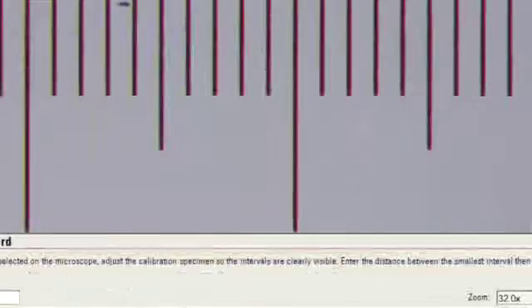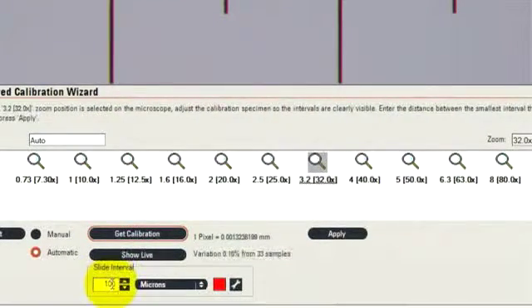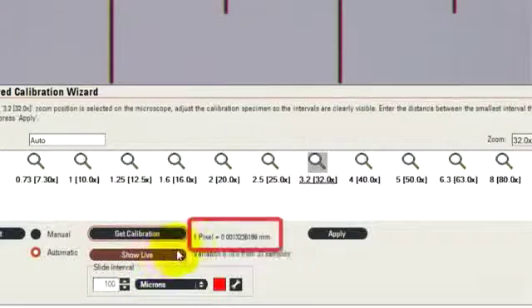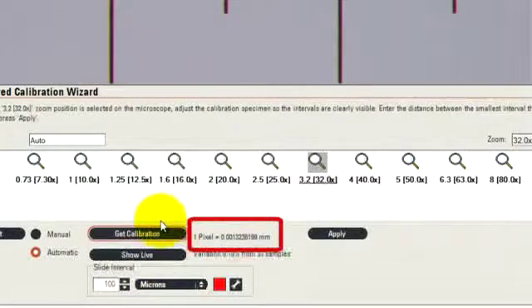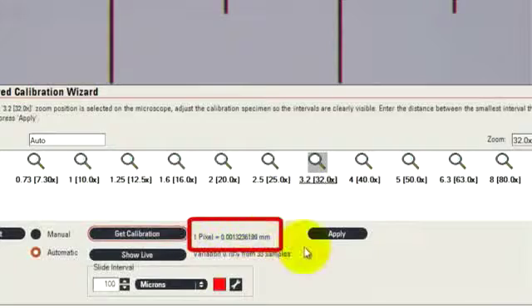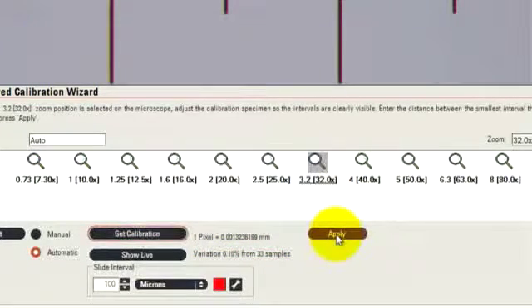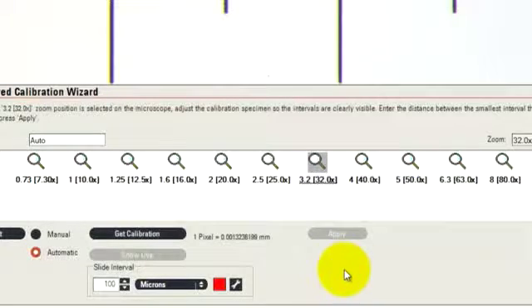Because we knew that the interval was 100 microns, the calculation has now been measured much more precisely than I can do by drawing lines by hand. And I can click Apply to store that measured value.